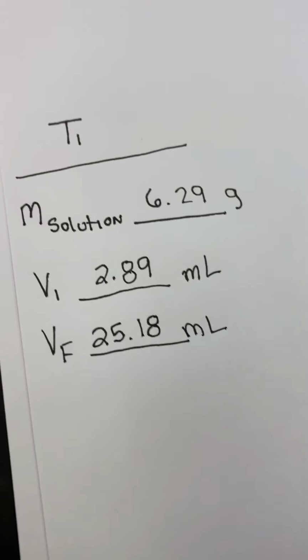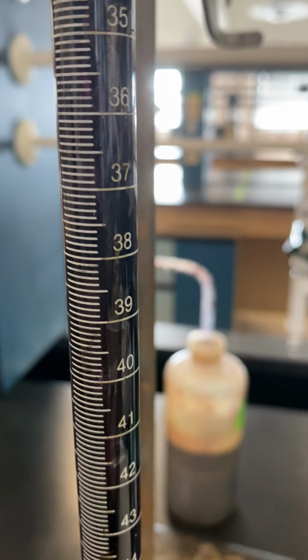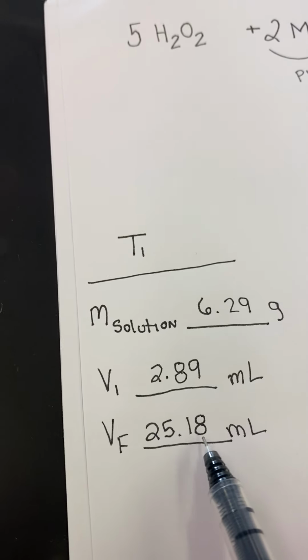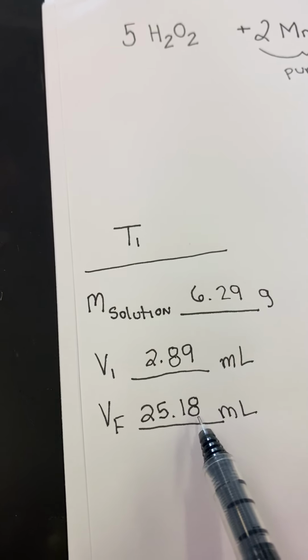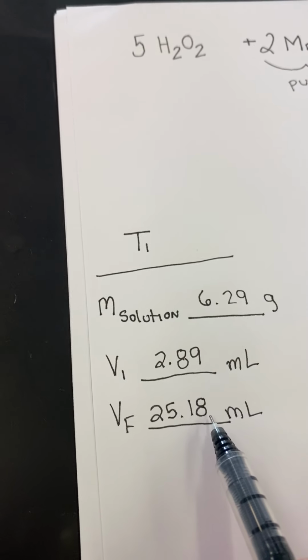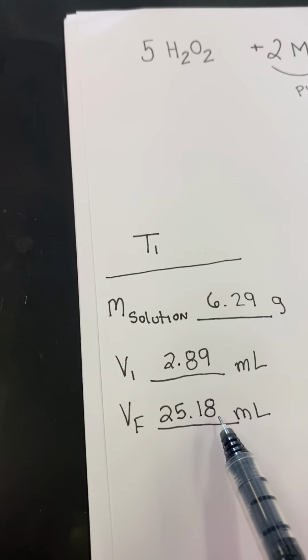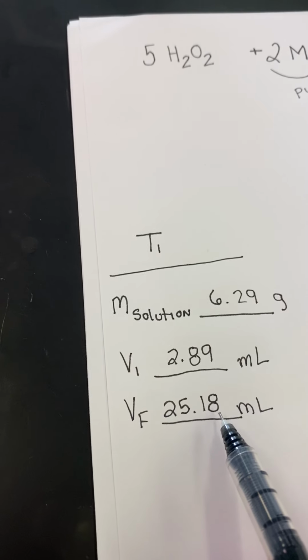Again, it's required that I have 2 decimal places because of my burette's calibrations. It's calibrated to the tenths place, which means we absolutely knew that the tenths place was a 1. We were approximating that 8. So in the hundredths place, we had error. We knew that we were guessing that place. Whether you said it was a 5 or a 2 or a 1 or a 0 or a 9, that was a guess, and that's where the error comes from, and we're totally okay with that.